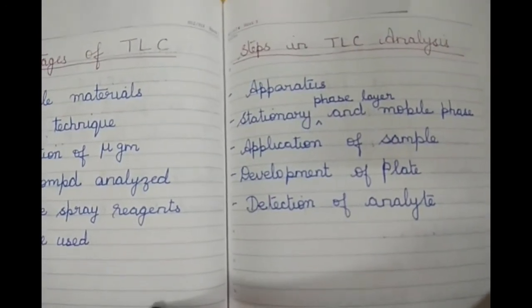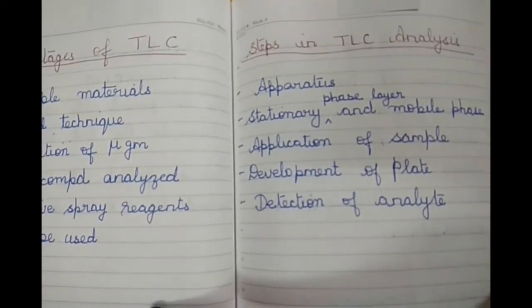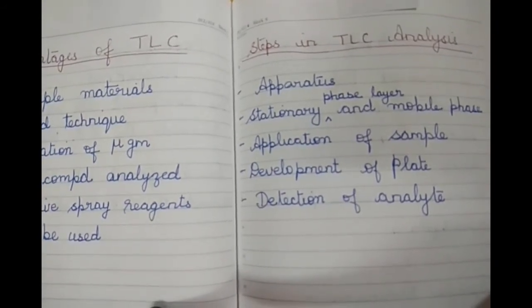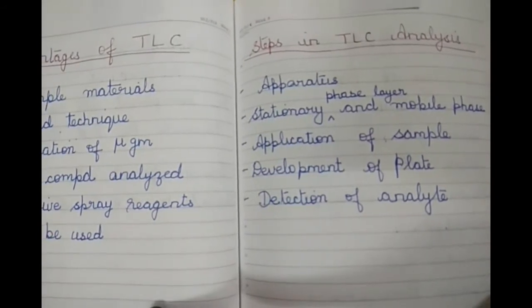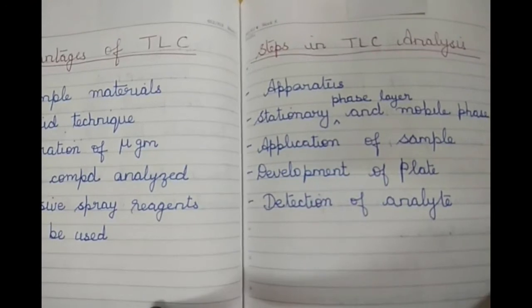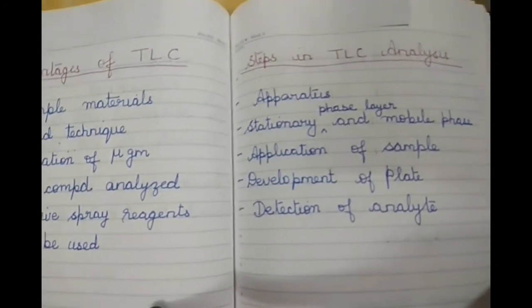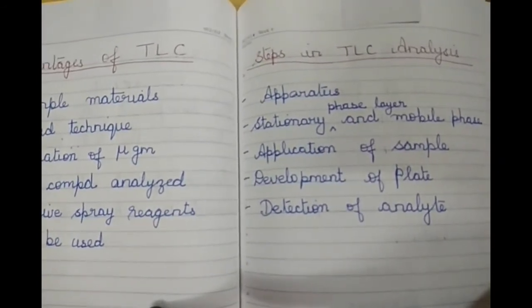Now the steps in TLC analysis. The following are the important components of a typical TLC system. First is the apparatus, which is the developing chamber. Second, the stationary phase layer and mobile phase. Then is application of the sample. Then the development of plate. And finally, detection of analyte.